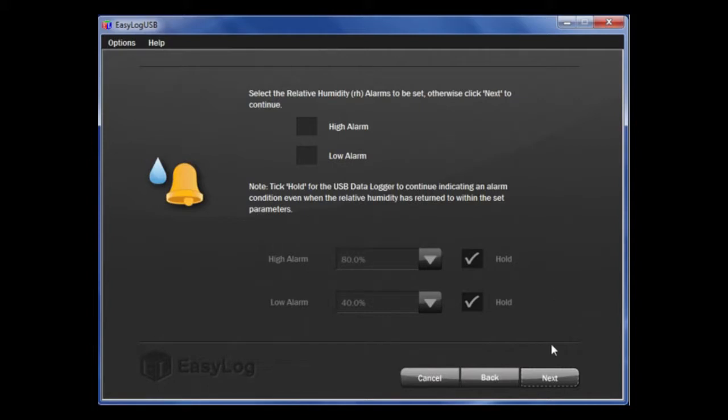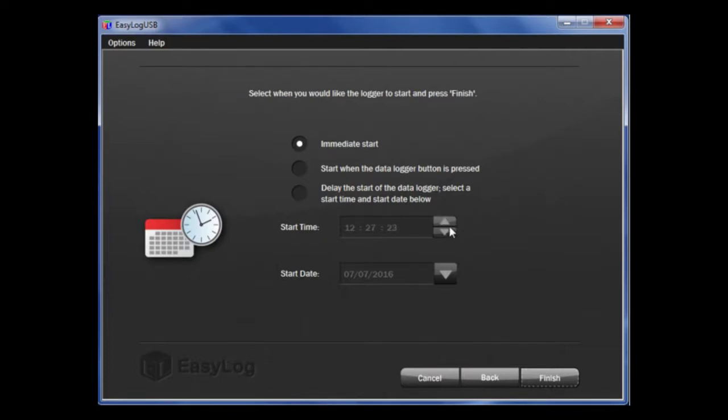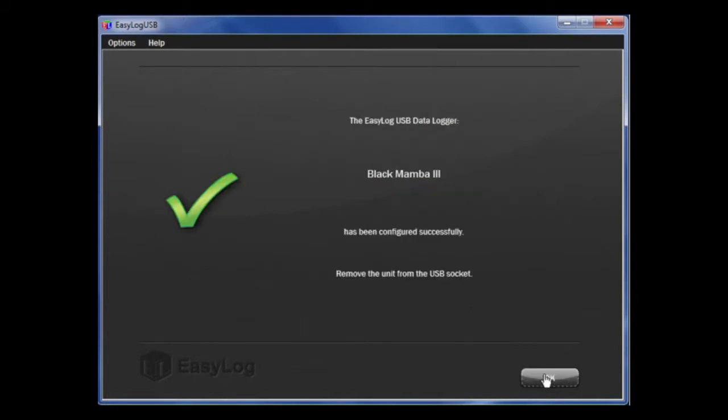Finally, you can set up how you want the data logger to start. You can start with an immediate start, to start when the data logger button is pressed, or select Delay the Start, which allows you to put a set time and date that you want the data logger to begin recording. Once that is complete, click Finish and your data logger is now complete. Simply click OK to exit.